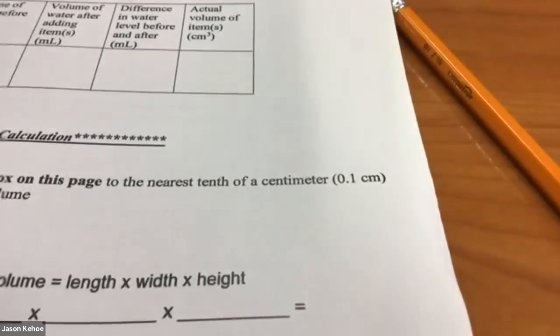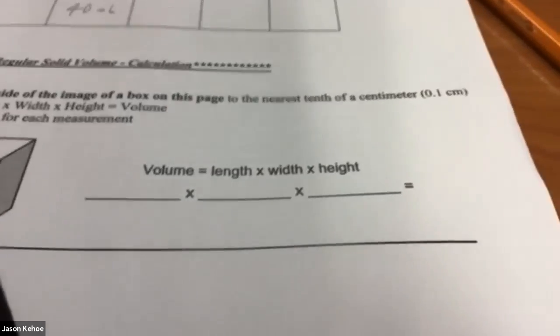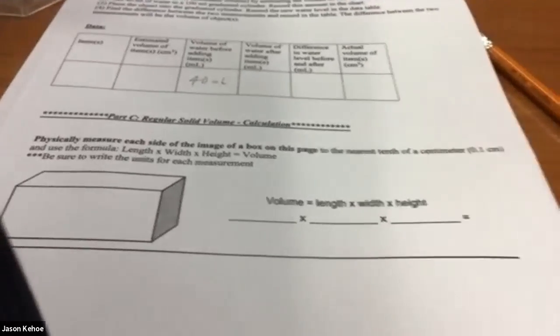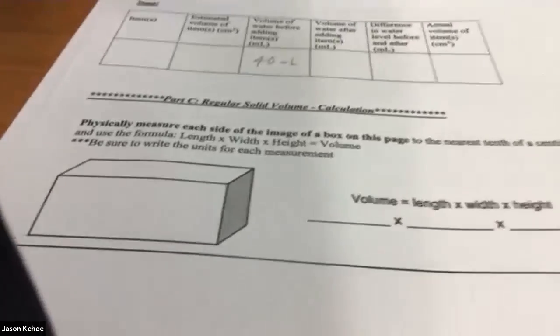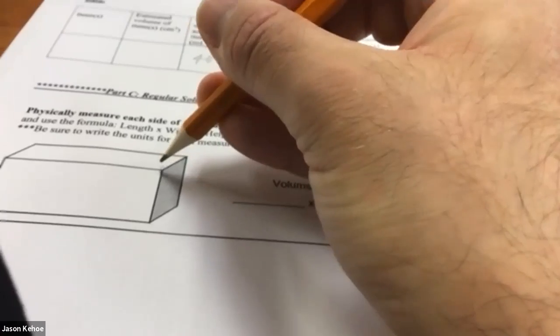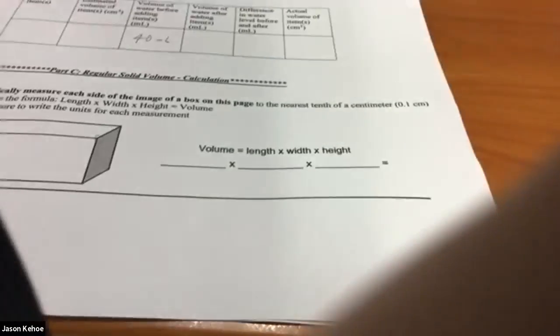It says to go to the nearest tenth of a centimeter. So I want to see decimals like 3.1, 4.2. I'm not saying those are the actual measurements, but that's the level of detail we're looking for. And then you'll multiply them to find its volume in centimeters cubed. And make sure you use that method in the notes that we saw for how to make sure you're not accidentally measuring the same side twice. The one I liked the best was choose a corner and measure every edge that comes out of it. That way you know you're measuring 3 different dimensions.